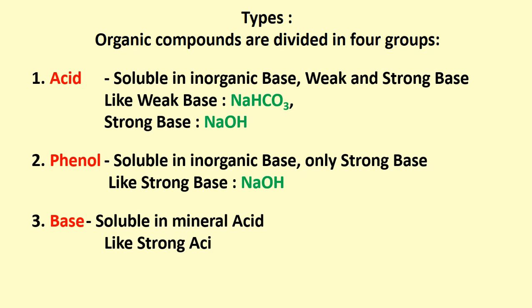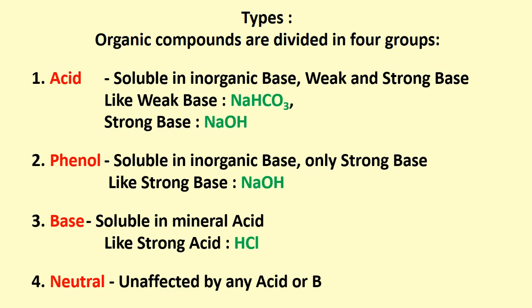Next, the third one, base. Base is soluble in mineral acid. Mineral acids are inorganic acids, strong acids like hydrochloric acid. So base is always soluble in acid. And the last one is neutral. Neutral is unaffected by any solution, acid or base.